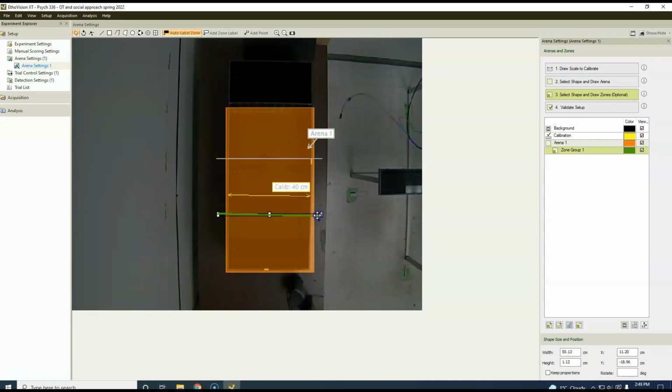That's good. Okay. And we're going to do one more. Actually, I don't like that. Let me see if I can get that down a little bit. Okay, there we go. And draw one more that's on this one here.